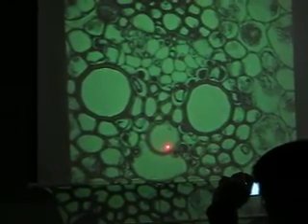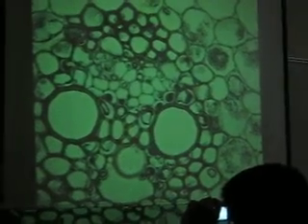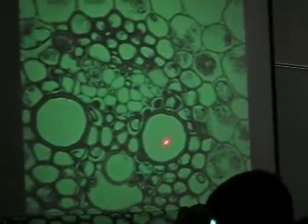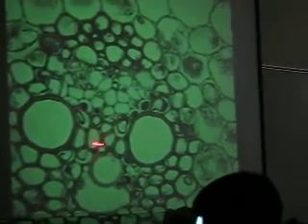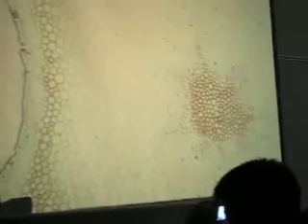The xylem that matures later, vessel, would be what? Metaxylem. So protoxylem, metaxylem, and a bunch of other metaxylem cells in a vascular bundle. Okay, now we're going to look at stele types, I guess.